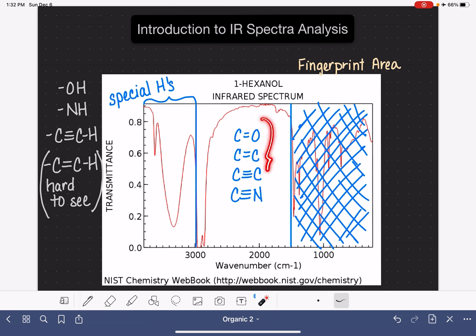All of these peaks, if the molecule has these functional groups and it is asymmetrical, all of these peaks are easy to see because they are strong or medium intensity. They're very sharp. They're all very characteristic. So you should never have any issues finding these peaks if they're present.